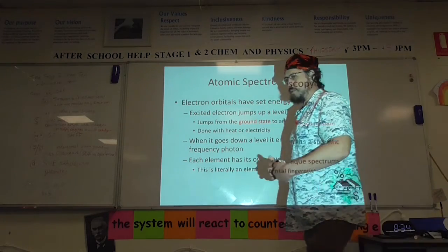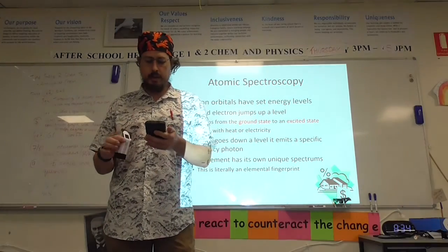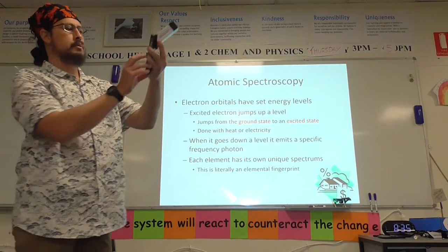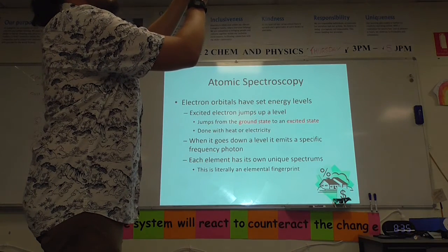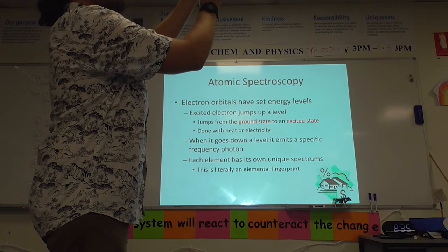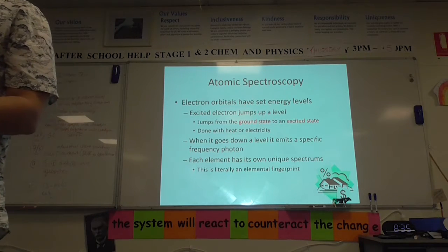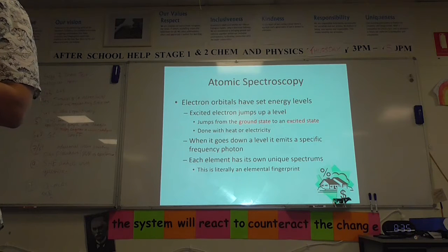These mobile phone spectrometers use a little piece of cut up DVD that acts as something that divides the light. So I've got a camera on right now. Hopefully this works. See that? Oh, it's a rainbow. Your eyes can't see that because your eyes aren't a spectrometer. But I'll tell you what, the world's actually a lot more beautiful than what we can see if you split the light up.